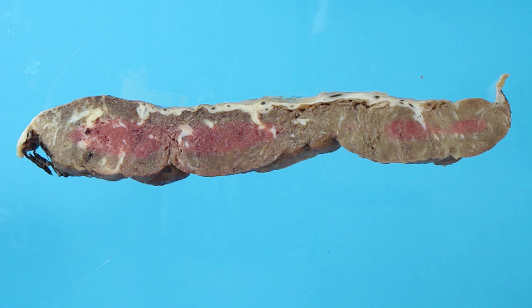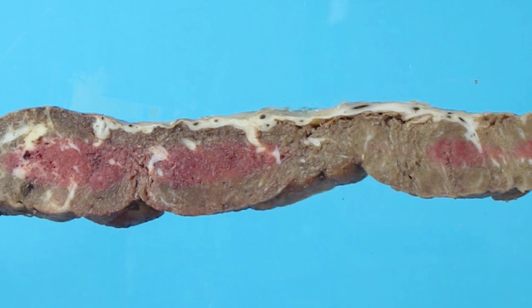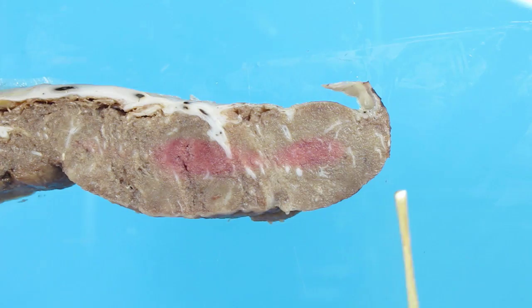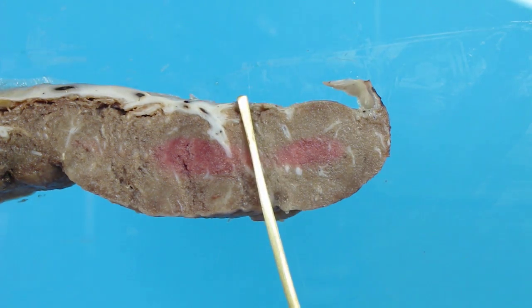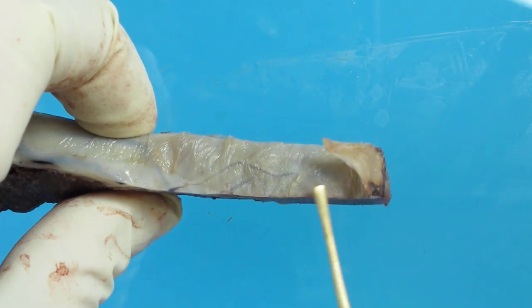In taking sections, we want to include the fetal surface where there are chorionic vessels. So a section such as this would include chorionic vessels and primary stem villus. This area here, as you can see of the fetal surface, does not have any vessels present. And when you turn it, you can see the absence of vessels.